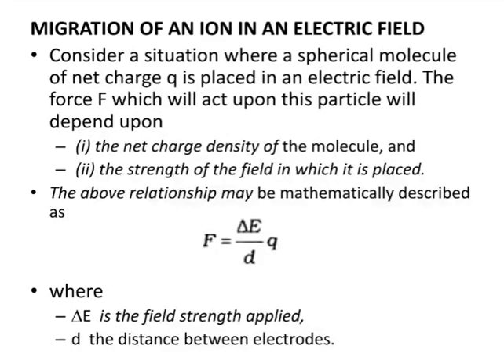Now, as we said, in electrophoresis, separation takes place under the influence of an electric field. So any sample molecules or molecular ions which migrate under the electric field must carry some charge. Consider a situation where a spherical particle of net charge Q is placed in an electric field.